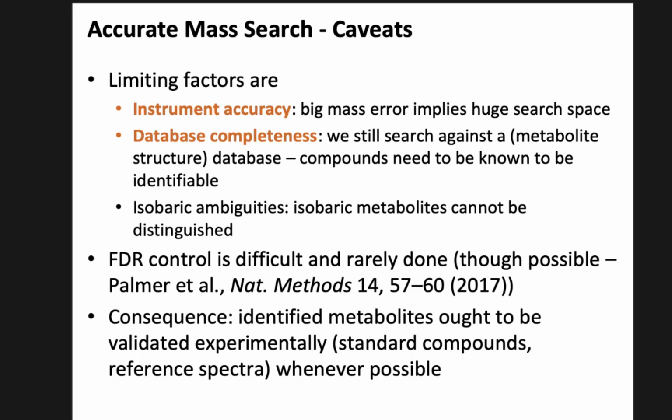Now, if you're working in, say, secondary plant metabolites of things that haven't been studied before, then the odds that you find what you're looking for in this database are pretty slim. And now the problem will be that you still get candidates. Most of them will be metabolites from animals, most likely. So you have to be cautious about that. It's not that easy to do it.